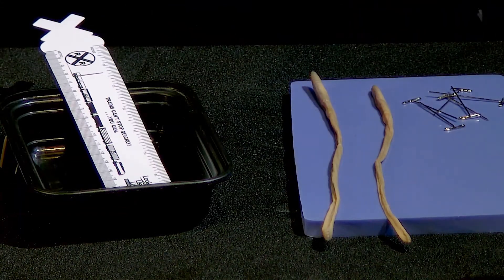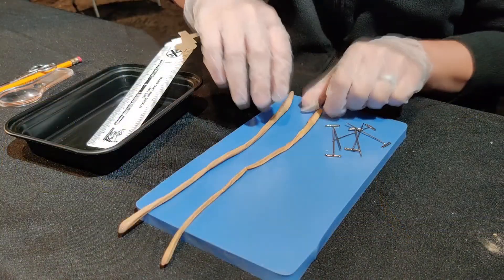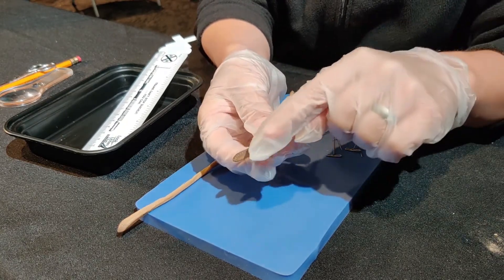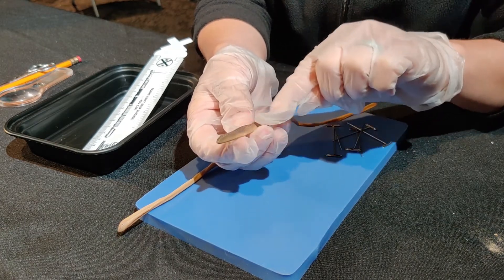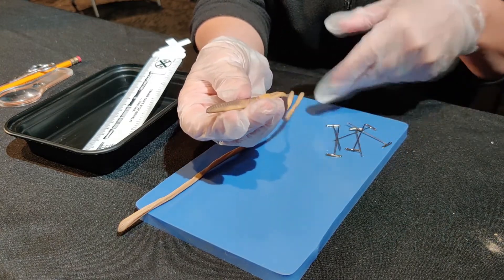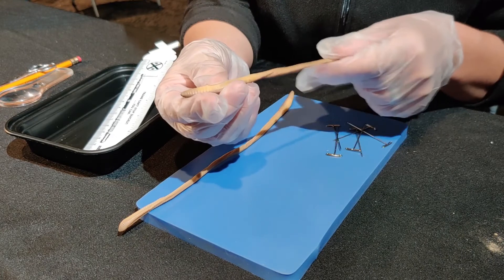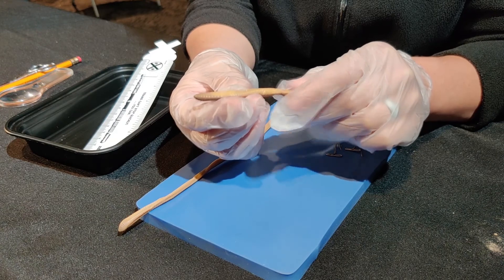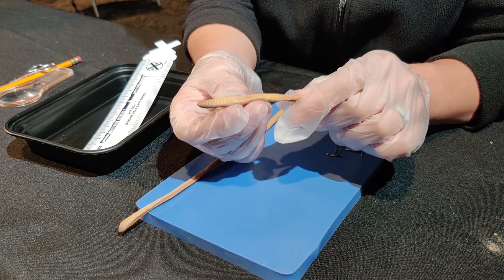To start off with, we'll look at the external anatomy of the earthworm. This is the dorsal side of the worm, where it has a darker color. This is the ventral side. On the bottom of your earthworm, there are small little feet called setae that look just like little hairs, though you might not be able to see them because of the formalin that the earthworms have been preserved in.